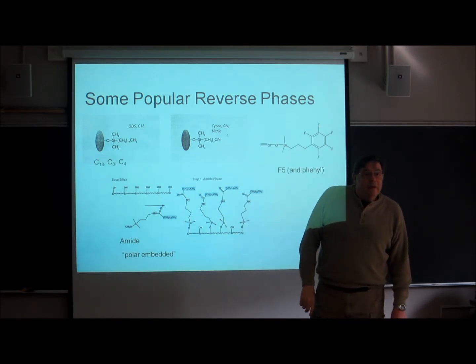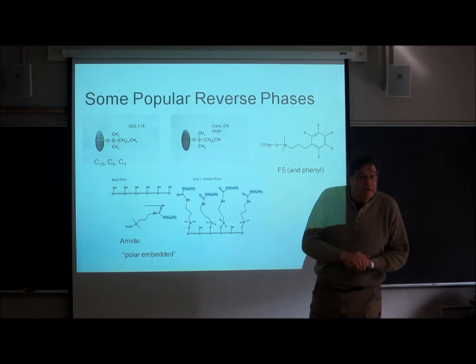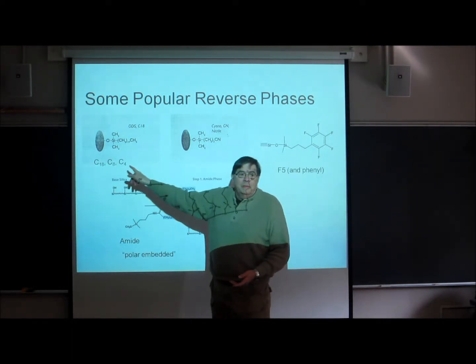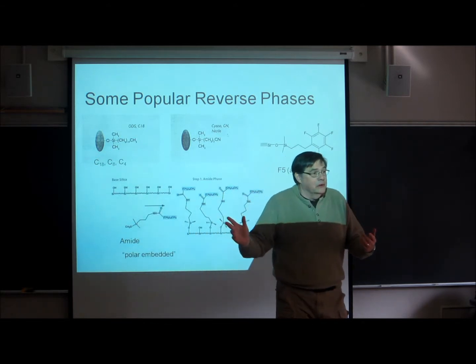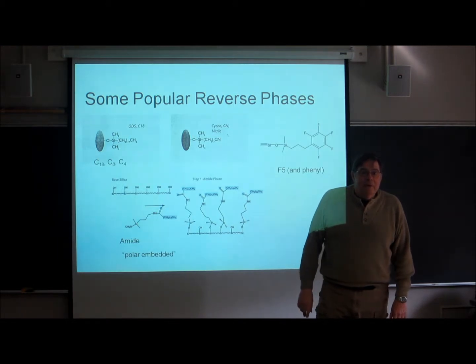It does okay. And you make a choice between C18 and C8 and C4 based on the particular application. Let me say that most analytical laboratories get their instrument shipped with a C18 column because it has the most general applicability. A company may find that the C4 works better because they don't need to do as much separating, maybe only one compound they need to analyze regularly. And the C4 works fine with that, and it's maybe less expensive.